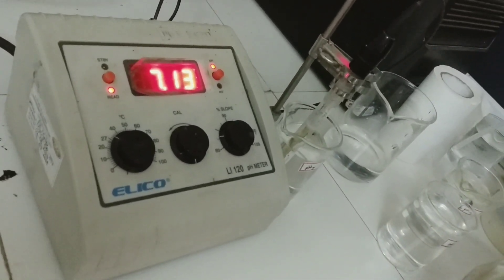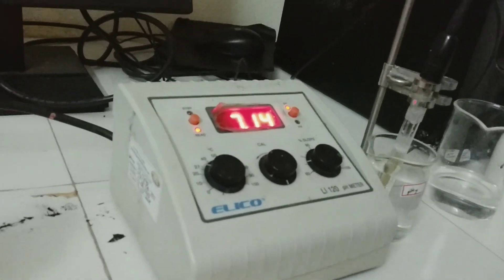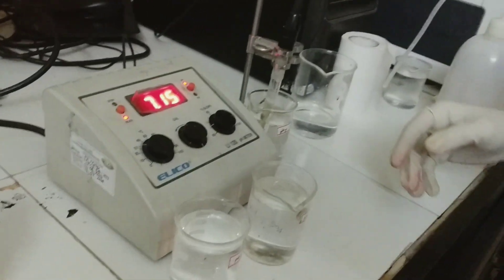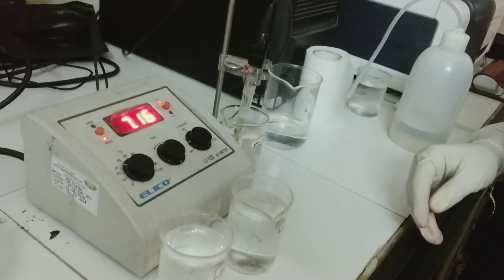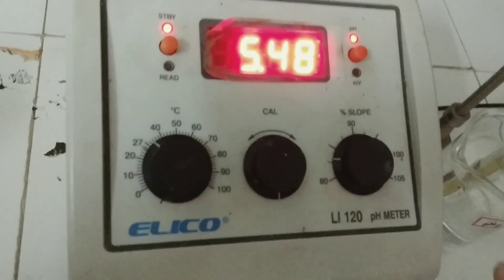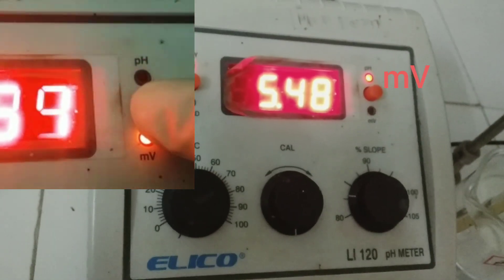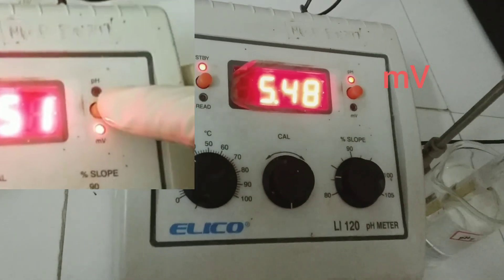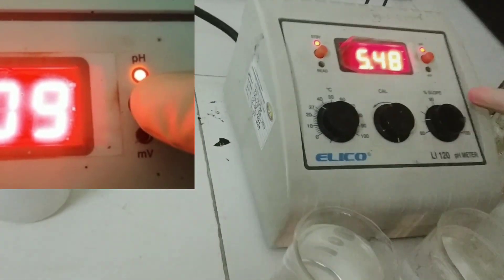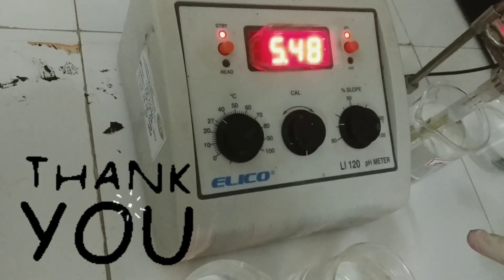This is the second step — when we placed the buffer solutions, the instrument automatically showed their pH values. Dear friends, this is how we calibrate the pH meter using buffer solutions. Once calibrated, you can measure the pH of any sample solution. We have completed the calibration of the pH meter. Putting it in standby mode. There is also a millivolt knob for potentiometry — soon I will be back with another video performing potentiometric titration using this pH meter, where we will measure the potential of the solution. Thank you and take care.